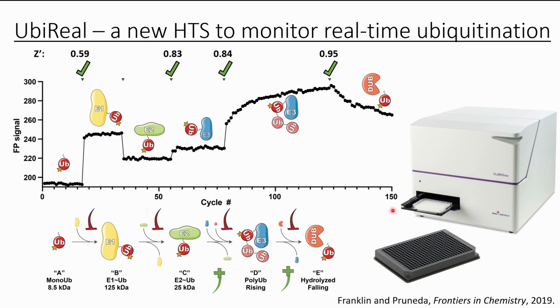Another powerful aspect of this assay is that it lends itself, because of its fluorescence polarization protocol, to a high throughput format. And so in the end, we were able to publish this assay in Frontiers in Chemistry last year, and then we were able to also write an application note for BMG Labtech.